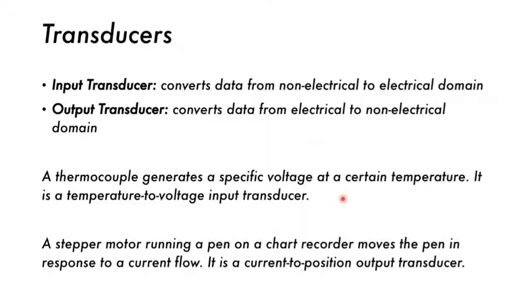So in the sense that if we have those instruments that have a little dial on them that tells us a certain voltage, there needs to be a step converter to convert the potential or the voltage inside of the circuit into an actual readout for us to read, because we as humans are not very good at reading electrical signals, but if it says 1.2 volts, we can read that. That's something we can do. So there has to be an input transducer and then an output transducer. The output transducer in a computer would be the screen and the process inside the computer which creates the output on the screen.